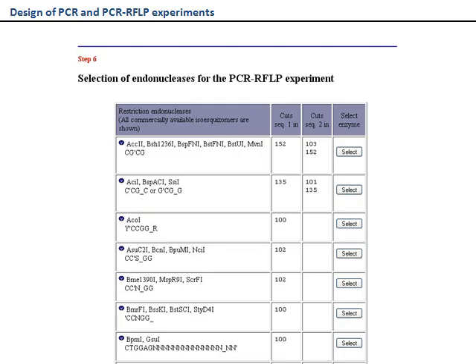Often, 2 or more commercially available endonucleases with identical recognition sequences and cleavage patterns are available. The enzymes with these characteristics are called isoschizomers, as, for example, in the noted lists of enzymes. The selection of the exact enzymes to use in a wet experiment depends on factors like the temperature of the reaction, the buffer, and so on. Clicking on a small image next to each enzyme will show the commercial source of each endonuclease.